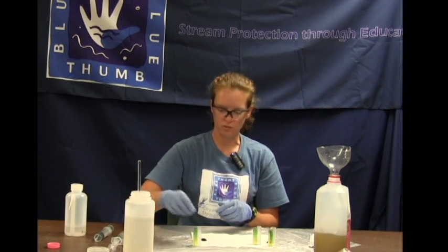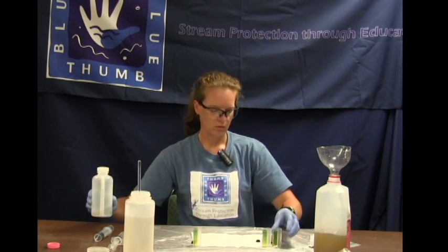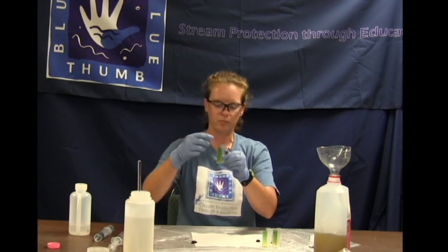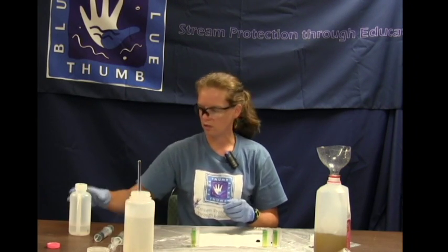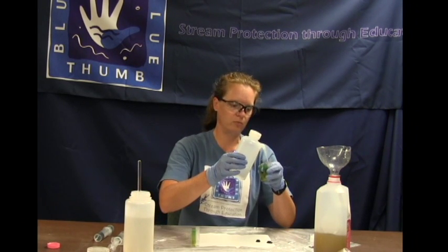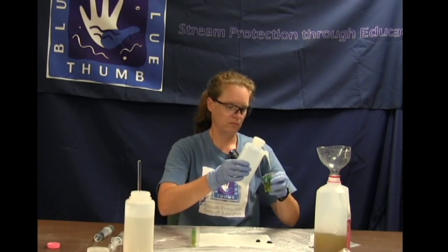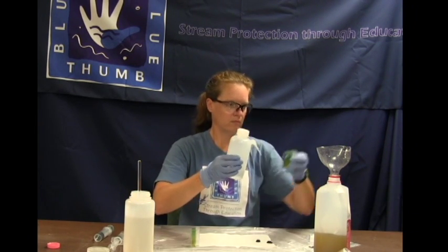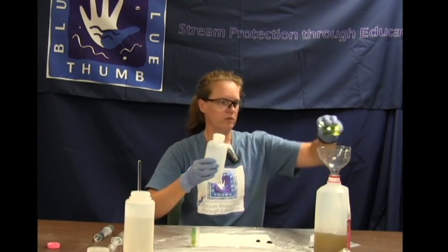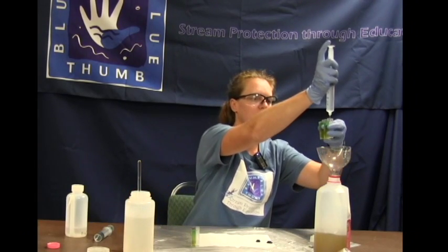So I usually set mine on one side, and the 2 are going to be creek waters. Or you can number your test cubes on the side or something like that, a blank and 1 and 2, just to help you with any sort of confusion that might happen. So 2 test cubes are going to be rinsed with deionized water 3 times, and then also rinsed with creek water 3 times.